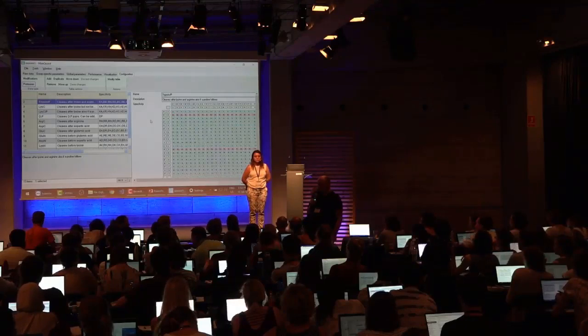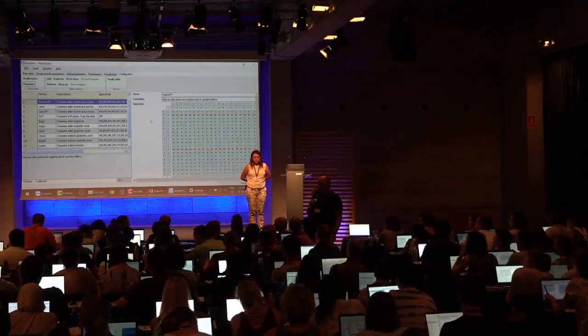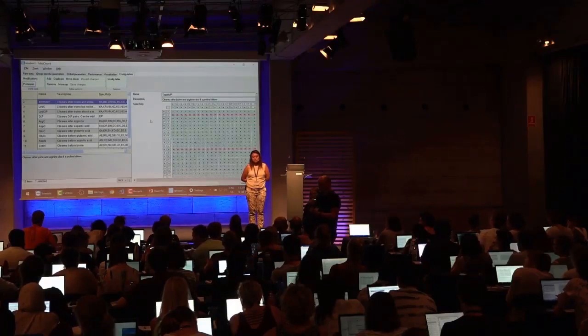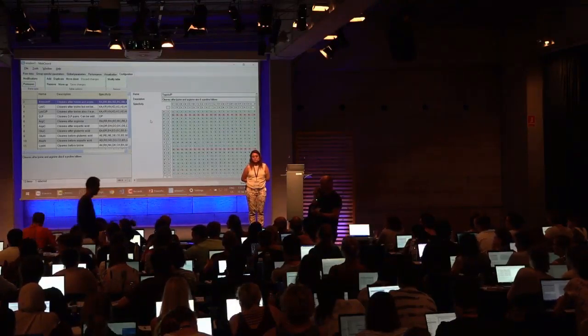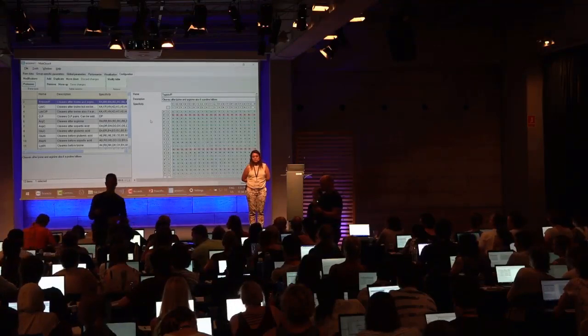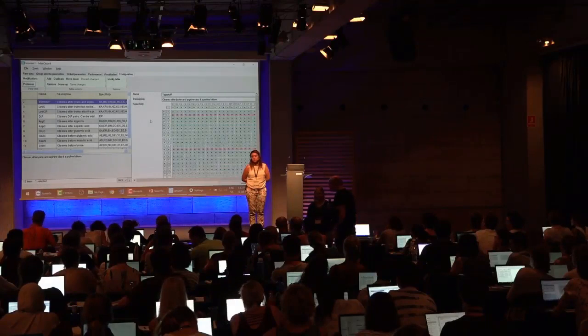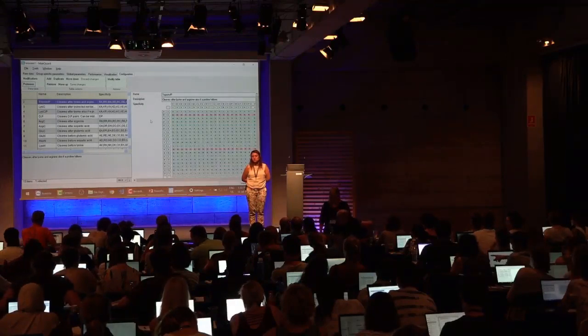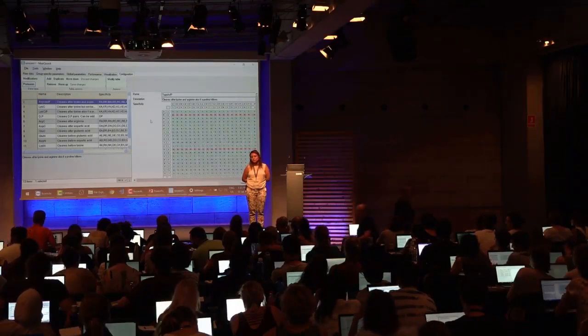You have never seen a case where it cleaves? It's okay to use trypsin P, no? So you're free to choose any of the two, right? But we definitely have seen examples where it actually does cleave. But of course, you could change during the setting configuration to trypsin if you don't want to use the default settings. That's why we are all here, to configure your search engines.